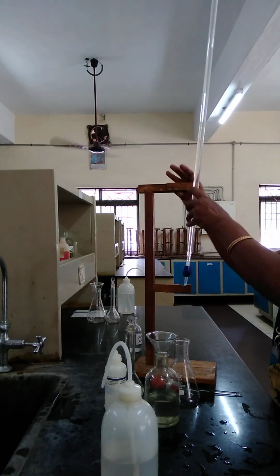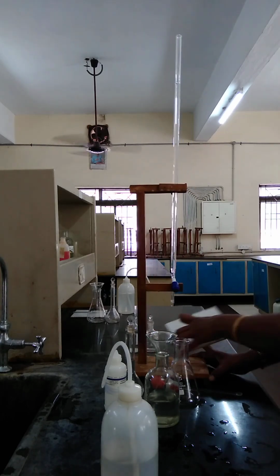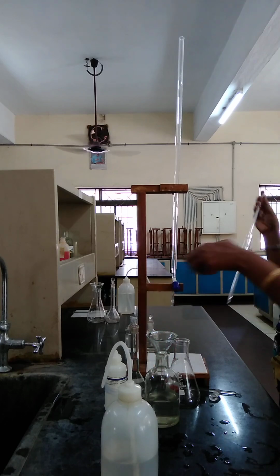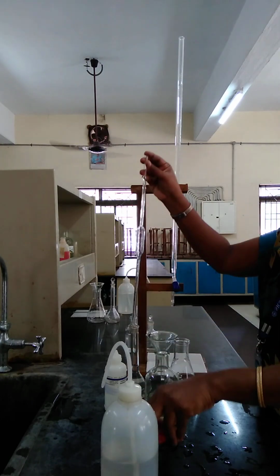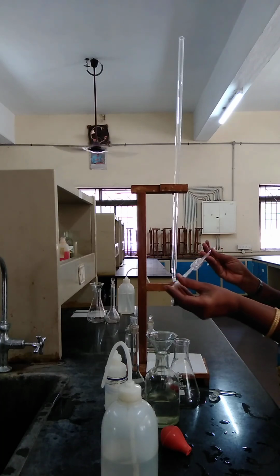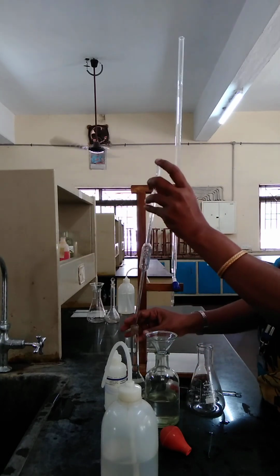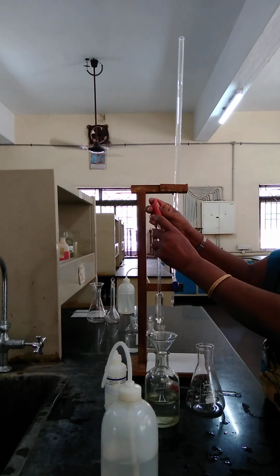Okay, now the makeup is over. Take the burette with sodium hydroxide, read the lower meniscus, and fill it at 20 ml. You have to wash the pipette with distilled water beforehand. Take a little bit and rinse, then rinse with the makeup HCl sample. Now take up 20 ml of the makeup HCl sample.